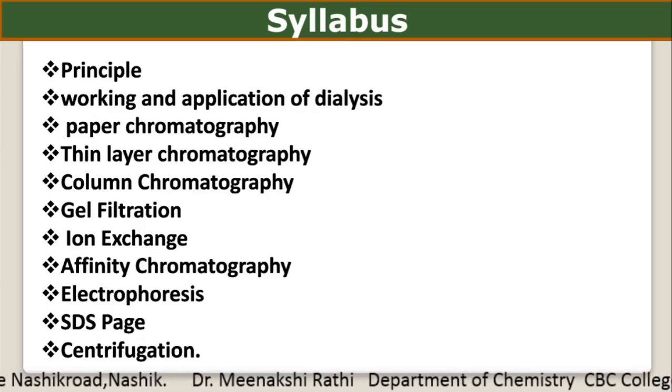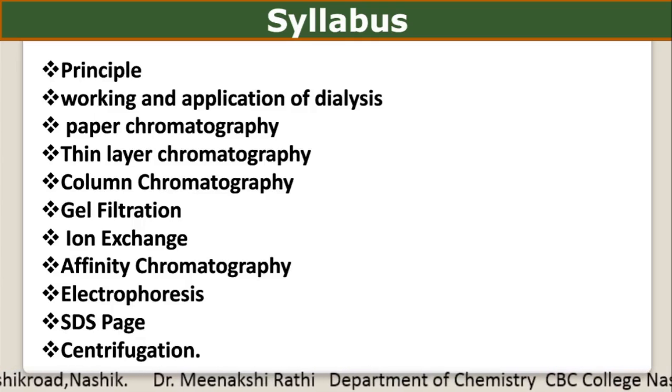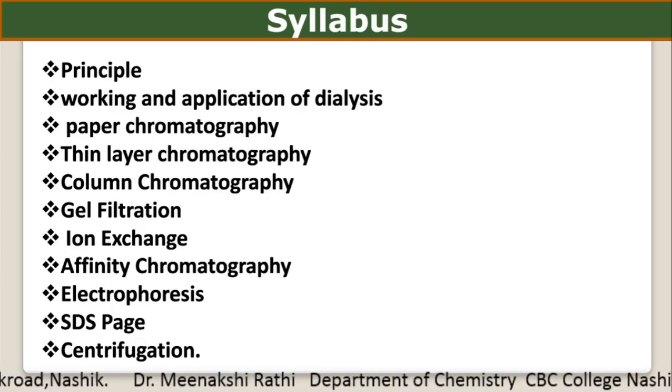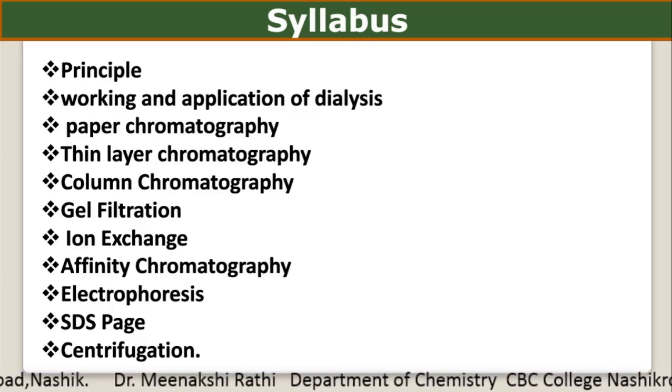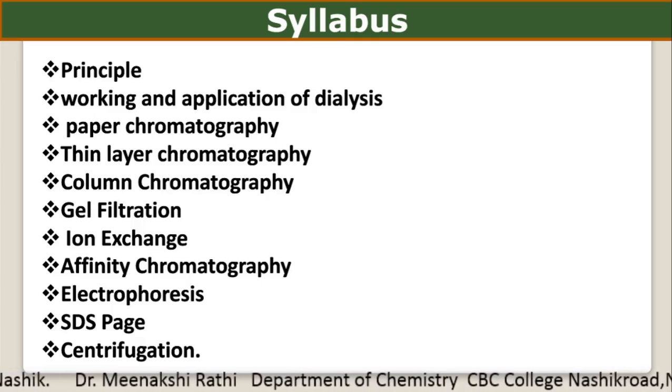So all these biochemical techniques are included in this chapter. We are going to discuss the principle, then procedure and applications of these biochemical techniques.